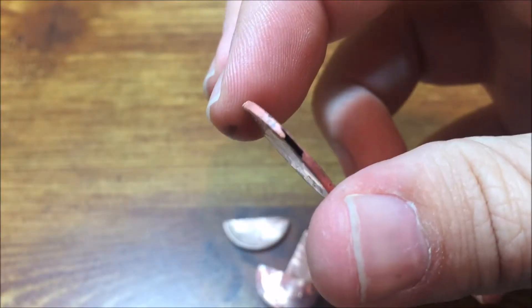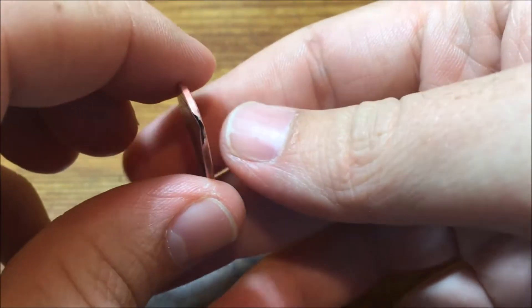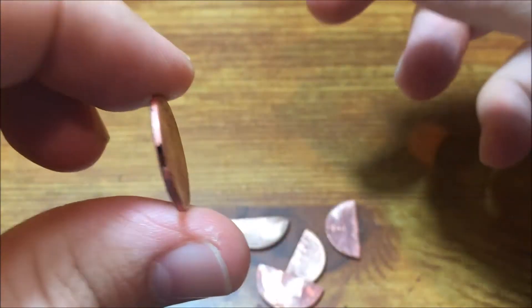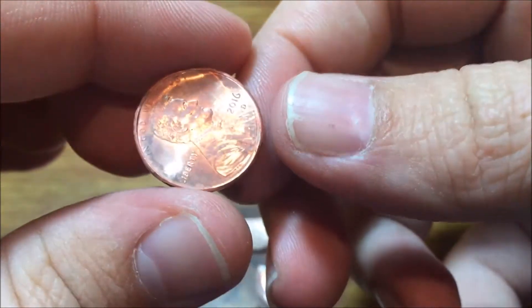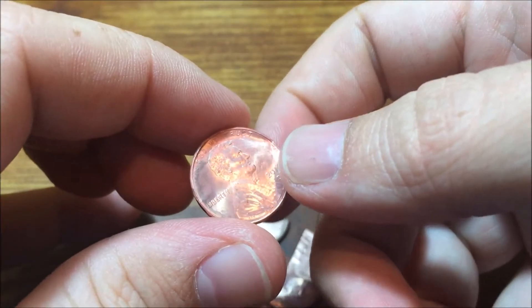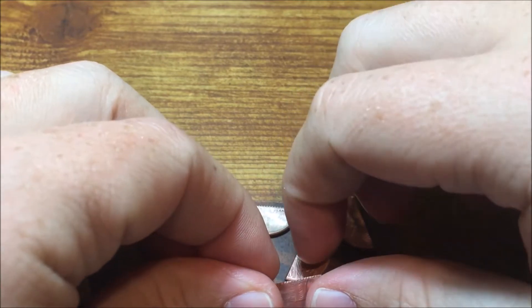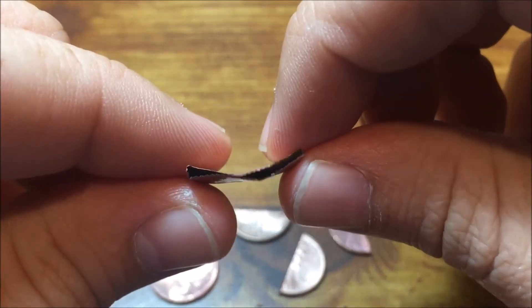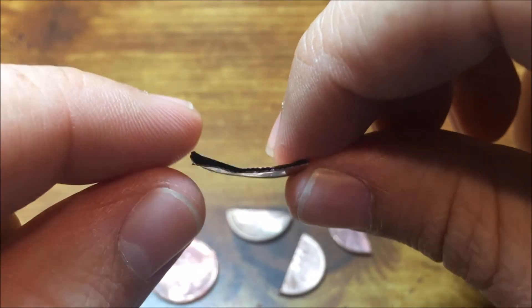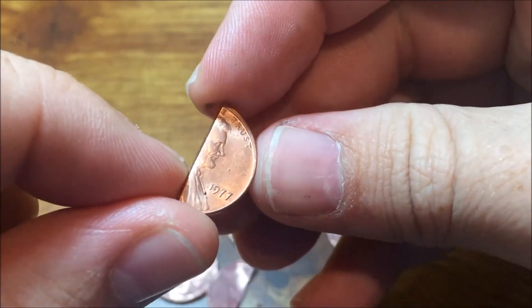The pennies are done soaking in the acid and the zinc pennies are essentially hollow shells. I wish you could all feel them — it's like aluminum foil, just a really thin foil. The coating of copper they put on these coins is quite thin. In contrast, the copper penny that was soaking in there the whole time is completely untouched by the acid.